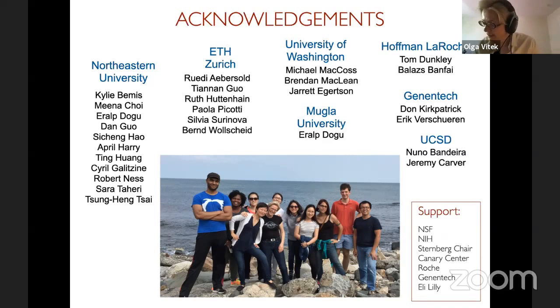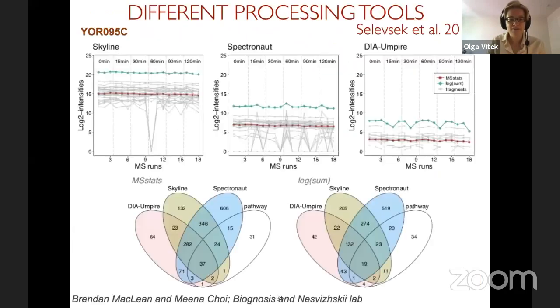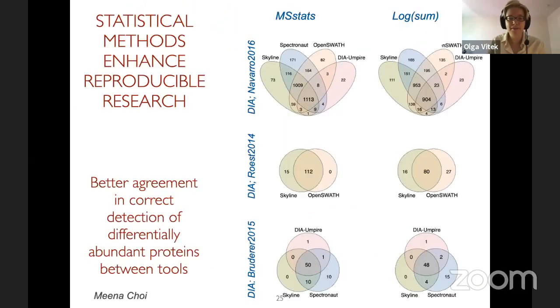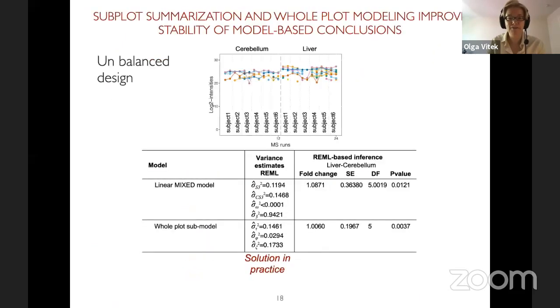So when does multiple testing happen? Multiple testing happens after we have p-values. Every time you have more than one p-value, you need to account for the fact that you have many p-values. Once you report a p-value, if you have 10,000 proteins, you have 10,000 tests. We use Benjamini-Hochberg adjustment for multiple testing, again primarily for reasons of computational stability. We think this is a good balance between sensitivity and stability of the results.